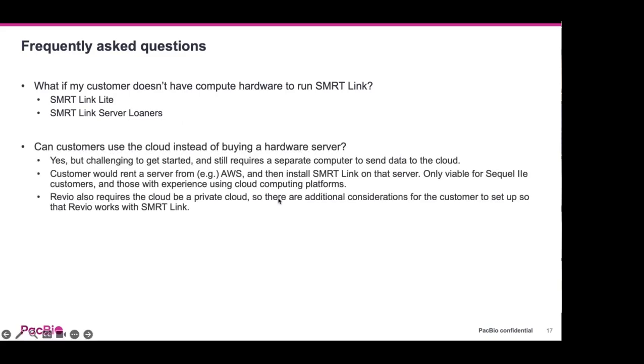Can customers use the cloud instead of buying a hardware server? Technically, you can install SmartLink on your own AWS instance. It's not recommended. It's quite difficult.